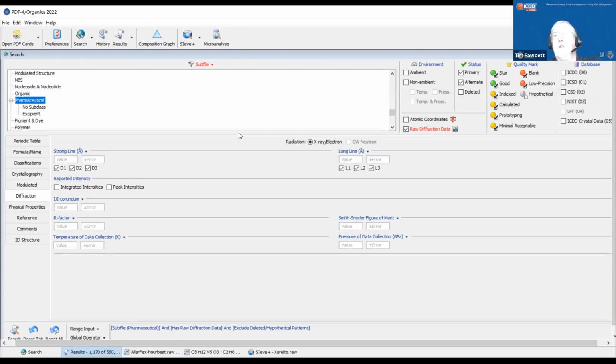Typically not, because I'm making the assumption in this case that the molecules are only a couple of atoms thick. Now, that may not be the right assumption. So I use the word typically. There's people doing amazing things like that using synchrotron data, where you've increased your sensitivity, increased your resolution. And I've seen people with synchrotron data look at layers that are 1 or 2 molecules thick. So as long as they're there, you can do it.